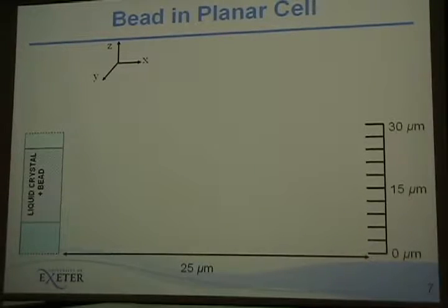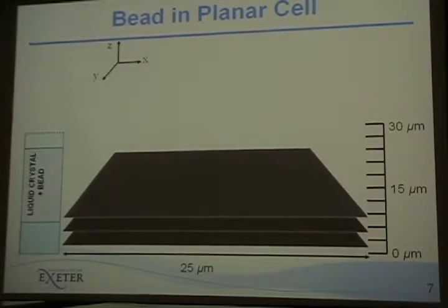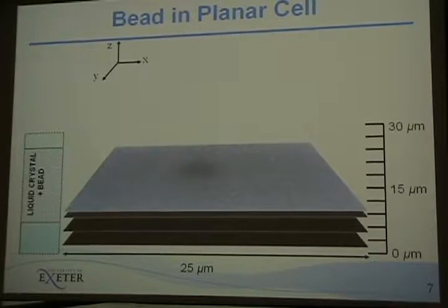So I thought I'd show you just a few samples of the sort of X, Y scans that we would get. In actual fact, we end up with about 120 slices in this particular cell, but I've just picked out a few. So we start off focusing into the glass, so it's completely black, there's no fluorescence in the glass, so we get no signal. And as we step up through the cell, we start to excite the actual bead, which is, in our case, the polarization of the light is parallel to the rubbing direction, so we're getting a nice bright signal.